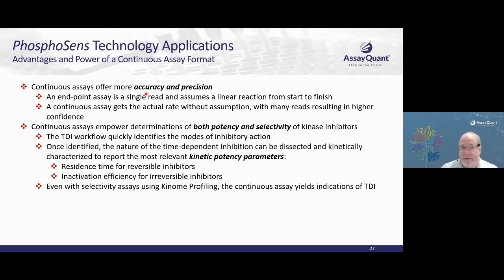If you're using IC50s, you may not be capturing the true potency, and your SAR could lead off in a different direction. And so even with our kinome profiling, single concentrations, you can actually get a quick peek if there is any time-dependent inhibition, which will suggest that you can use this kinetic format to further characterize your hit compounds, and that leads to really interesting ways of moving forward in all of this.